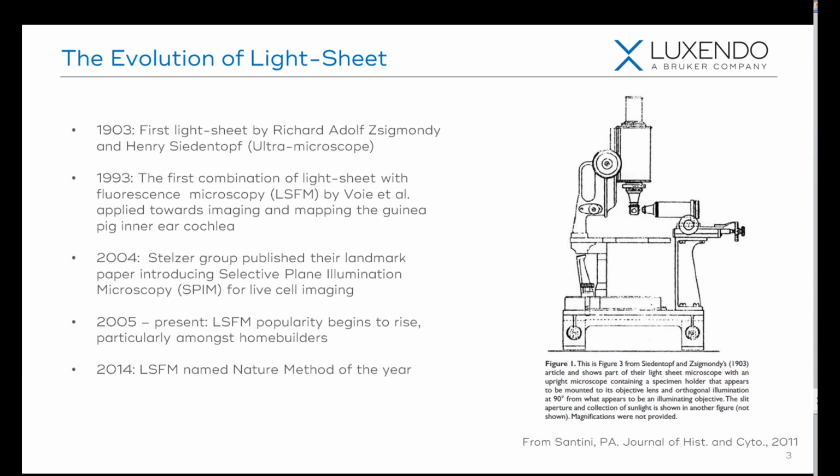And we saw lightsheet explode over the next couple of years, particularly amongst home builders who were building their own lightsheet systems to address their particular applications. And this was recognized in 2014 when lightsheet microscopy was named the Nature Method of the Year, really signifying the bright future of this technique.